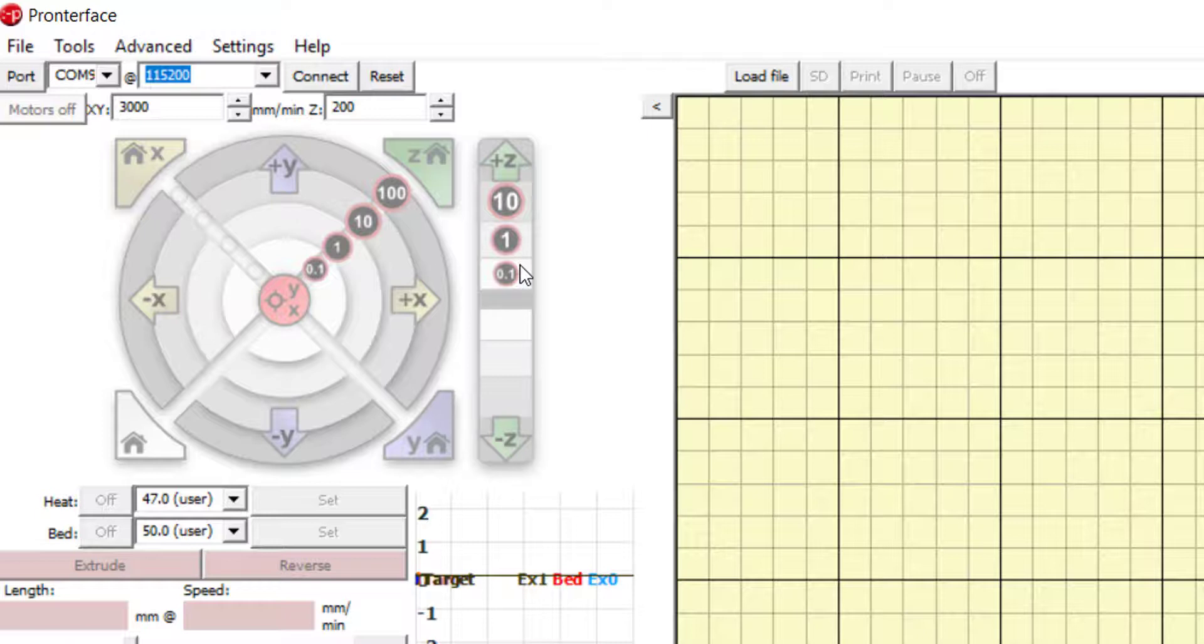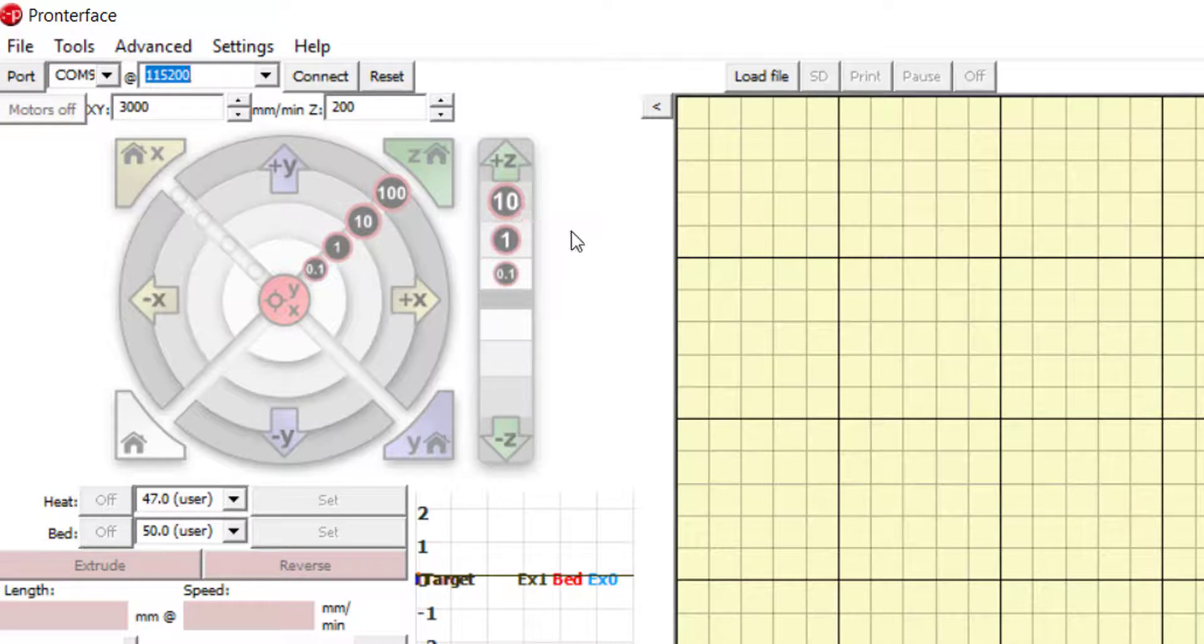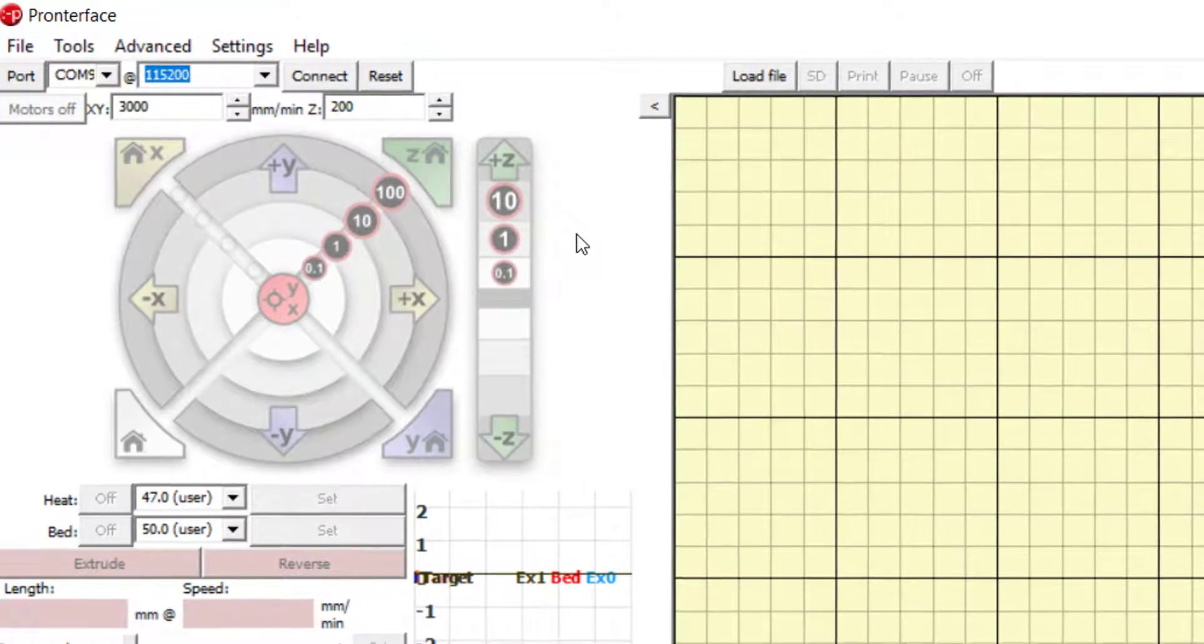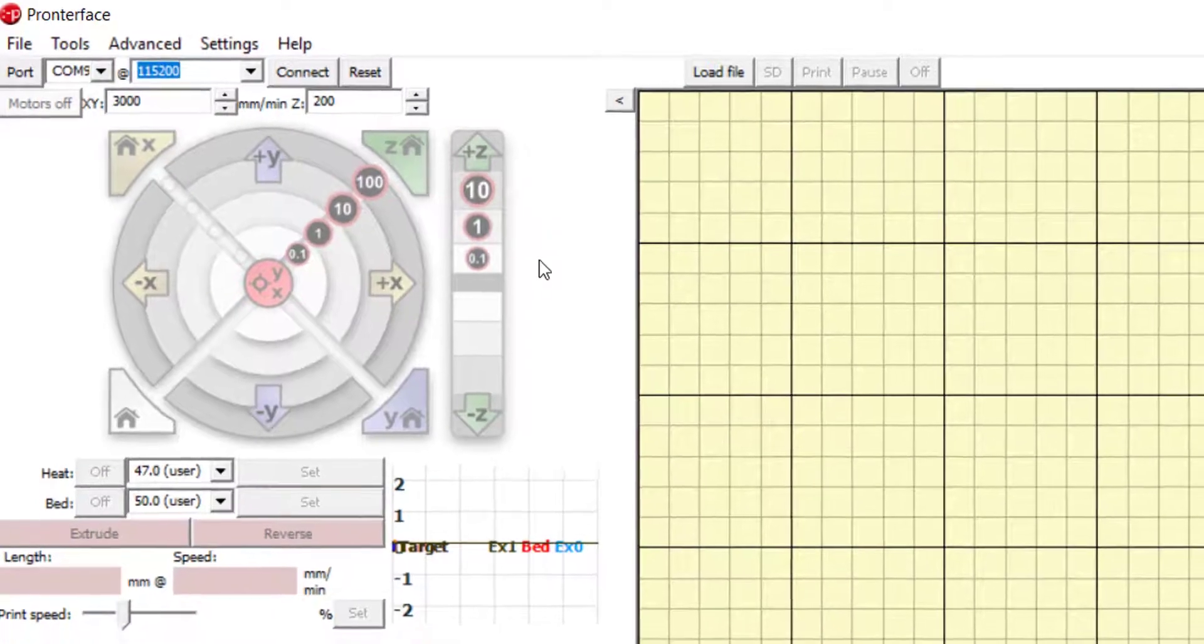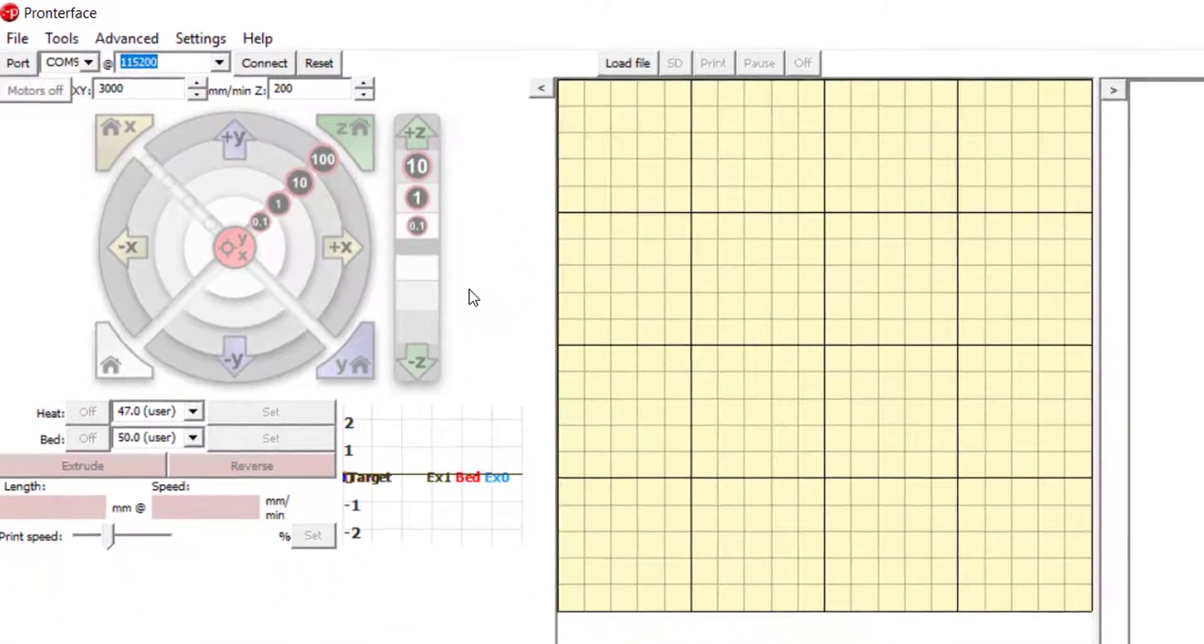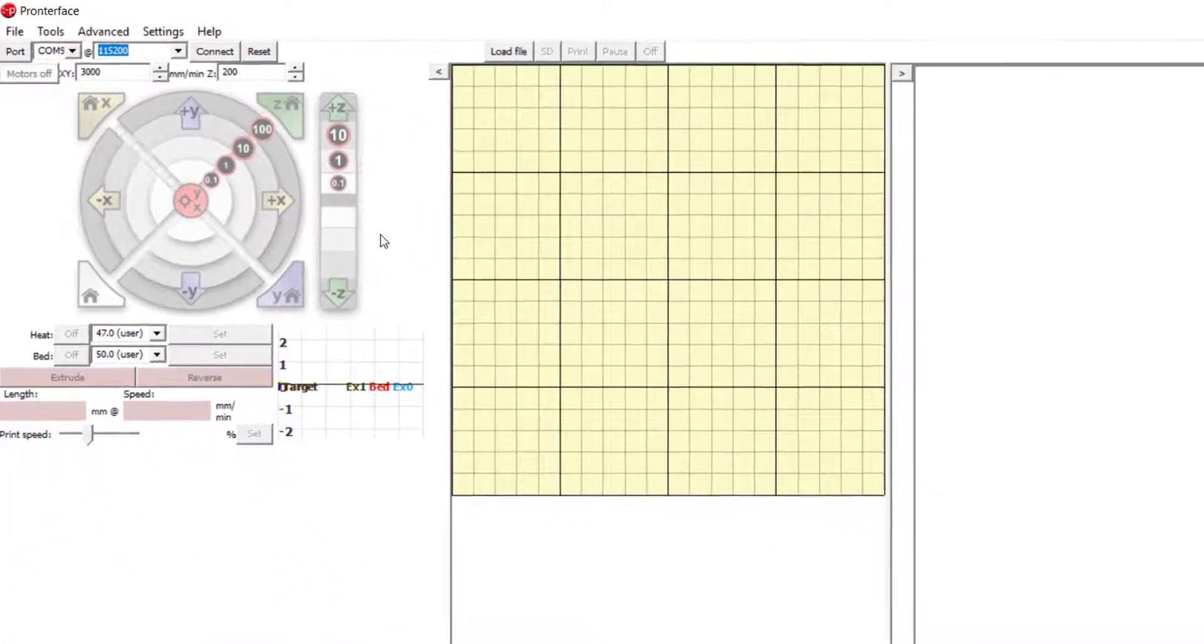You can also control the Z motion using the buttons to move the bed up or down by 0.1, 1, or 10 mm. Z corresponds to the difference between the extruder head and the bed. So positive Z will lower the bioprinter bed, increasing the distance between the bed and the extruder, while negative Z will move the bed up.